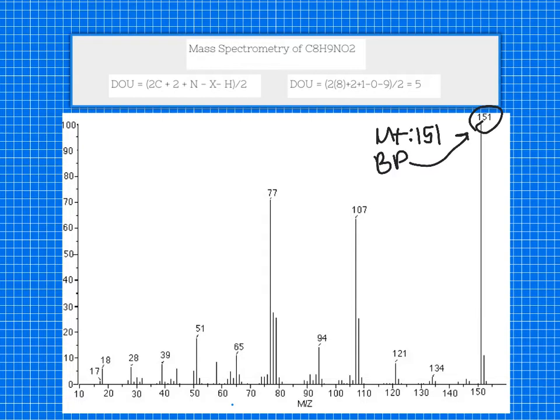In addition to this, we can also note that we don't have any halides present in our molecule. We would see certain patterns if we were to have them, but we also have the molecule name, so we know there aren't any.